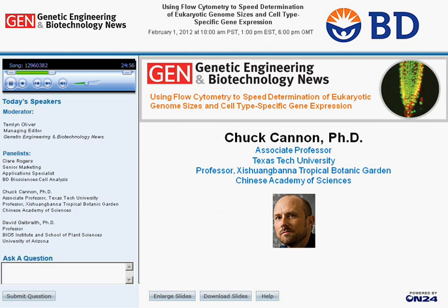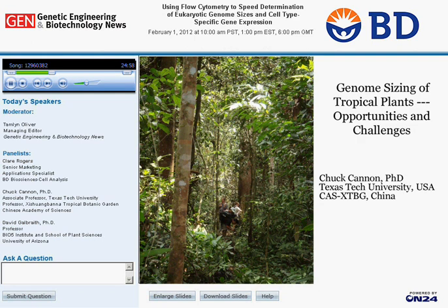Thank you, Tamlin. Today I'm going to be talking about genome sizing of tropical plants, and I think there's a lot of opportunity there because we don't know that much, and there aren't as many challenges as there used to be because of the many technological advances that have been happening. For example, the BD Accuri system that we're talking about today. Next slide.